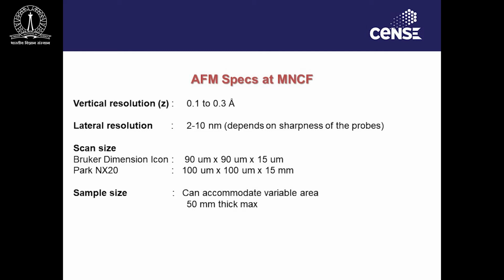And again, sorry, this is not mm, so there's a mistake here. So this is 15 microns again. The Z height is 15 microns.